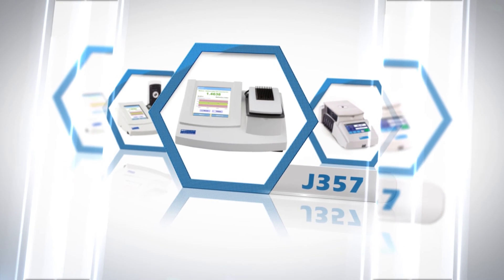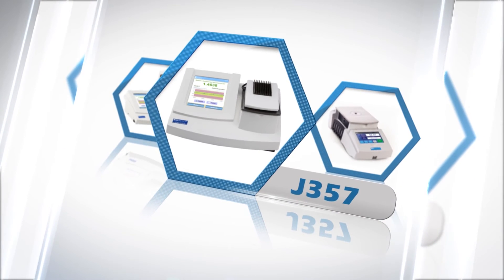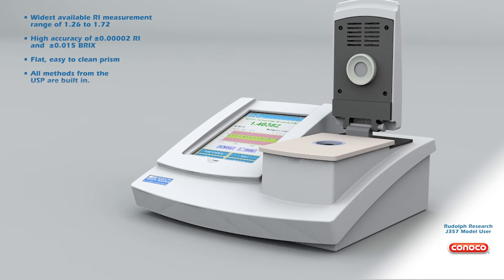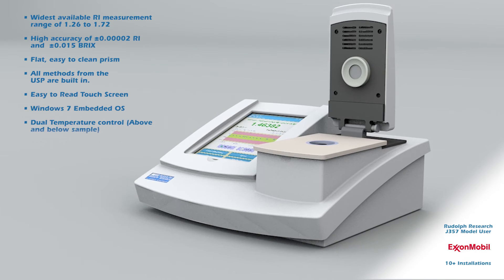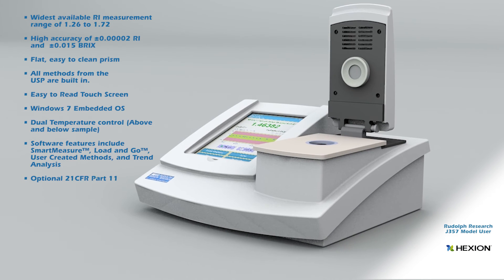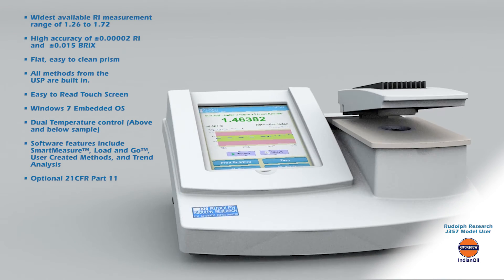Does your lab measure pharmaceuticals, chemicals, petroleum, essential oils, fragrances, or cosmetics? The Rudolph J357 is the instrument that measures them all. Designed to be a research quality instrument, it offers a wide RI measurement range and the high accuracy required to satisfy the most demanding laboratories and regulations. The J357 is available with software features needed to comply with 21 CFR Part 11, making it a top choice for highly regulated pharmaceutical laboratories.